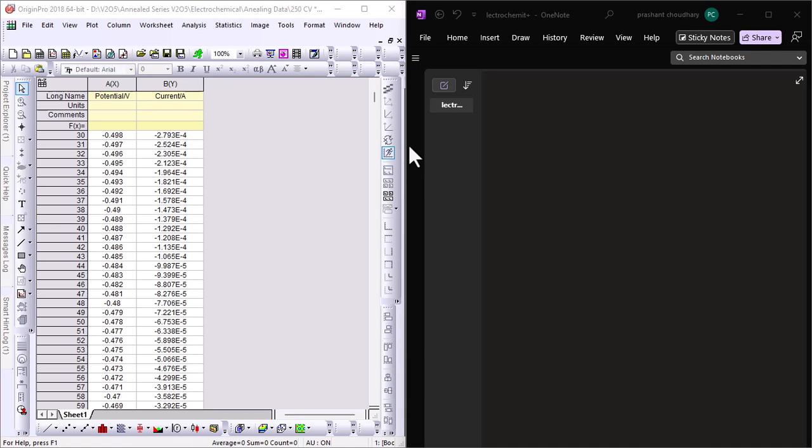During a CV experiment, a voltage sweep is applied to an electrode system, either a two-electrode system or three-electrode system, and the resulting current is measured. The current response gives us a CV curve, which is a potential versus current curve that contains all the information we need to calculate specific capacitance.